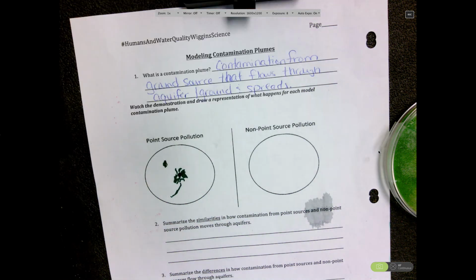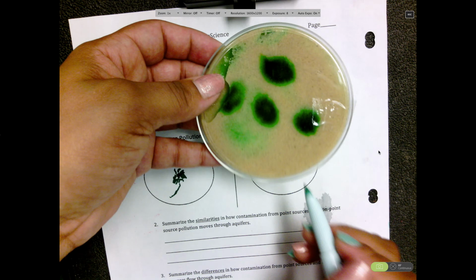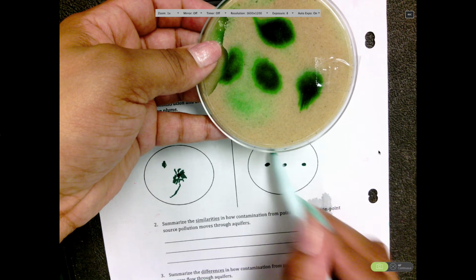All right? So now, let's take a look at our non-point source pollution, which means several areas. So we have a couple sources, and they've all spread it out.